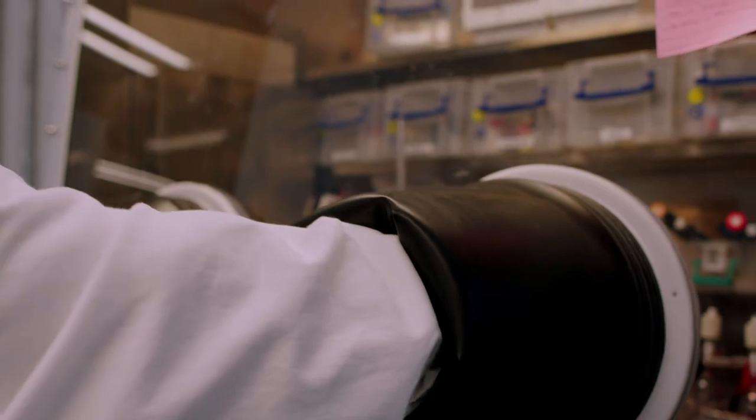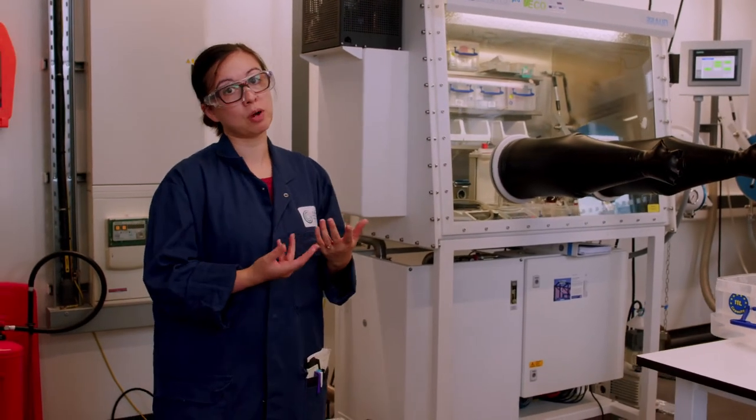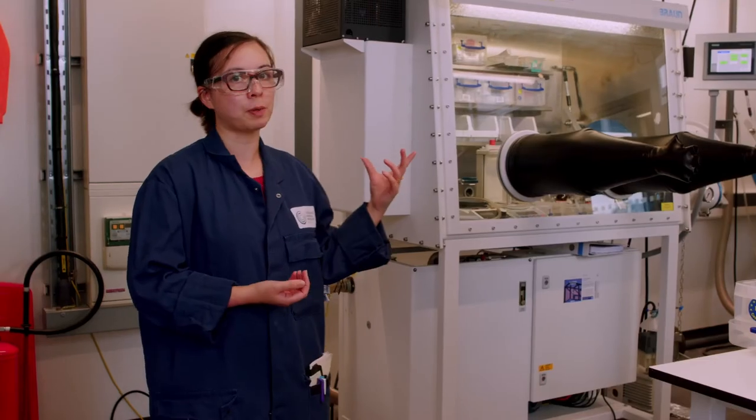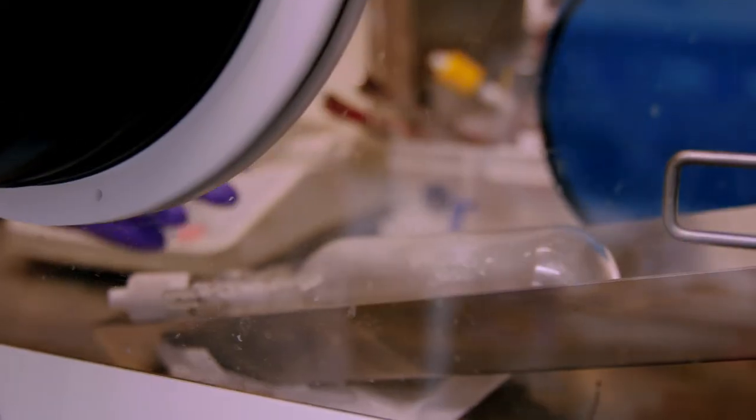So this is our air sensitive area. Here we have three glove boxes. They're all under argon and they enable everyone to work with chemicals that can't get exposed to oxygen. We use these as part of our polymer making or unmaking processes.